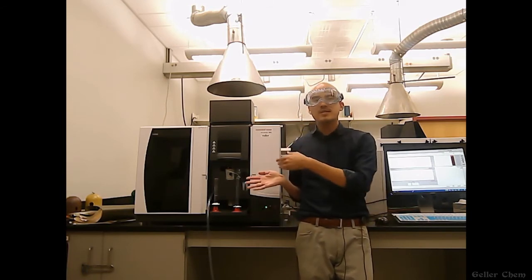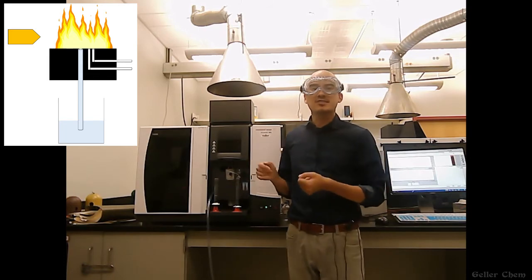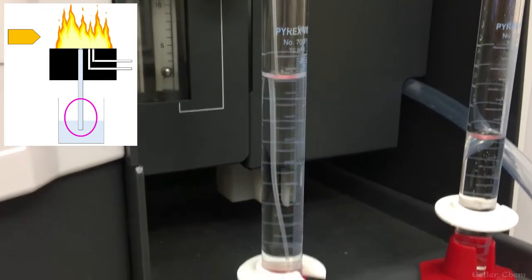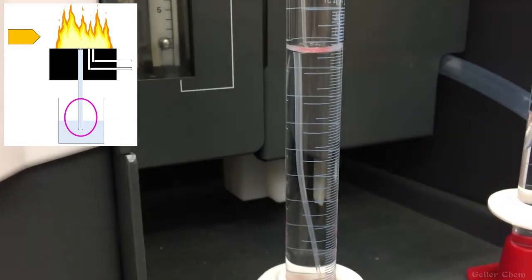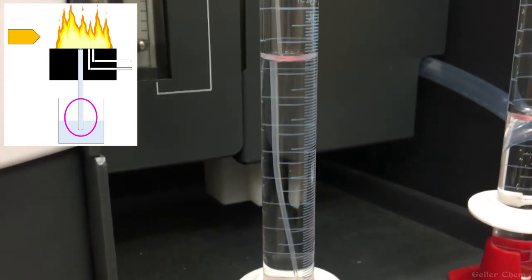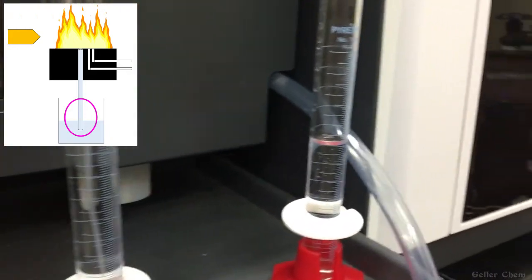So I'm wearing goggles in this video because fires can be a thing. But here's our instrument. There's our schematic. Let's just go through the various parts, starting with our nebulizer tube. Now, I have activated the instrument, and so we see this tube is inserted in water, and we can see that that water level is going down with time. And that's because the tube is aspirating and sucking up that water and sending it into the atomic spectrometer.